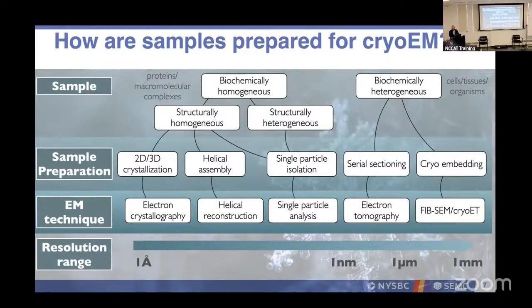So the ribosome, then, this morning, how thick is the ribosome? Is it less than 100 nanometers? Yes. Most of the biological macromolecules we're dealing with are typically tens of nanometers, or single nanometers, unless you're dealing with really complex phages and other things like that, which can get quite thick.